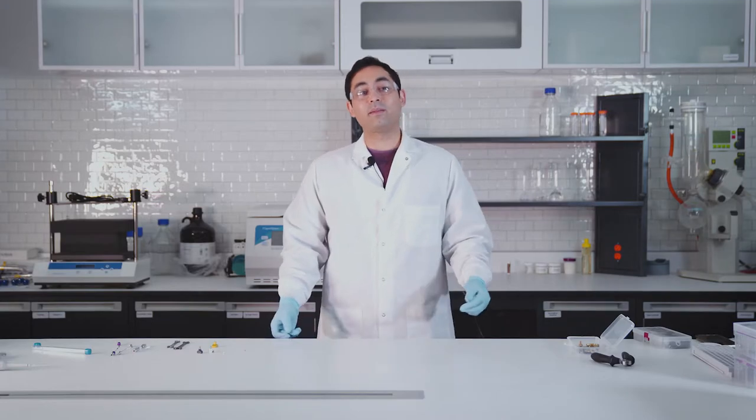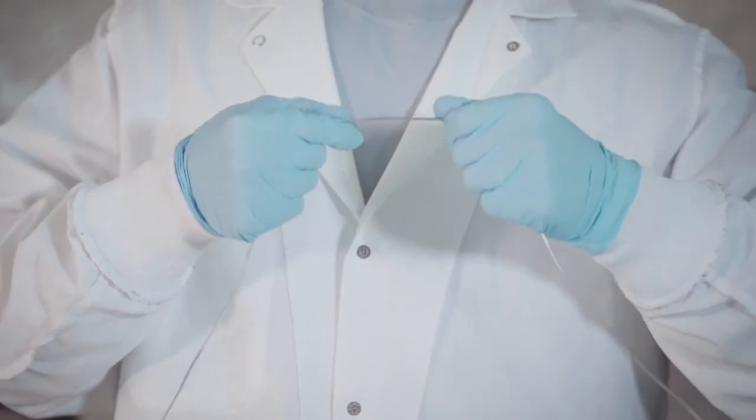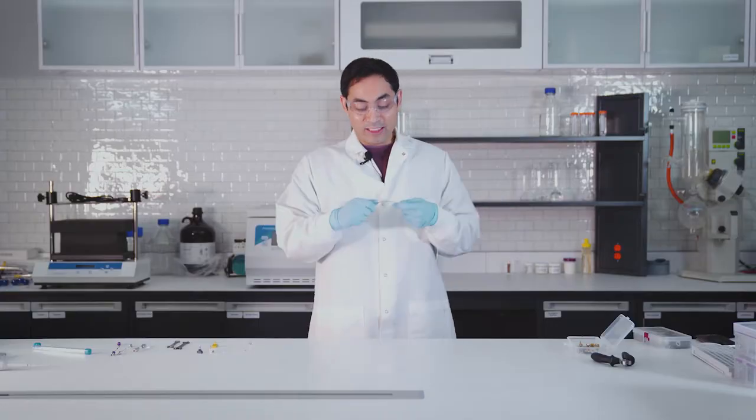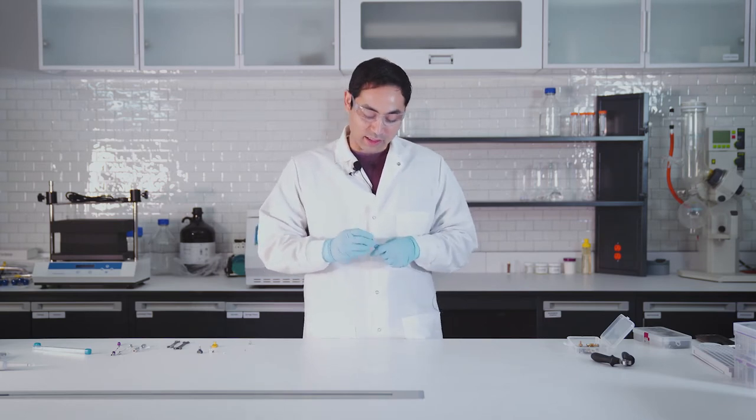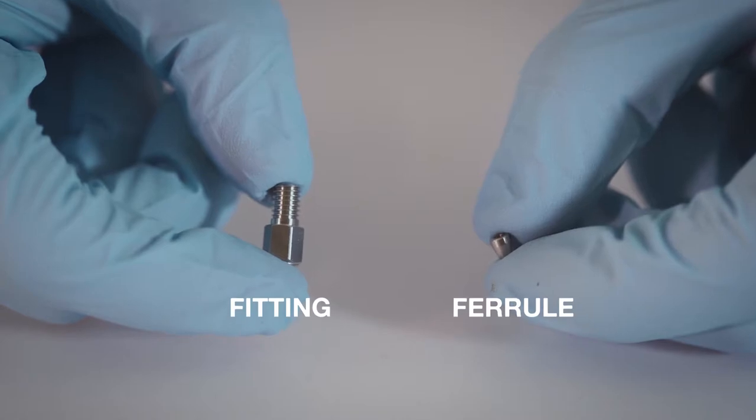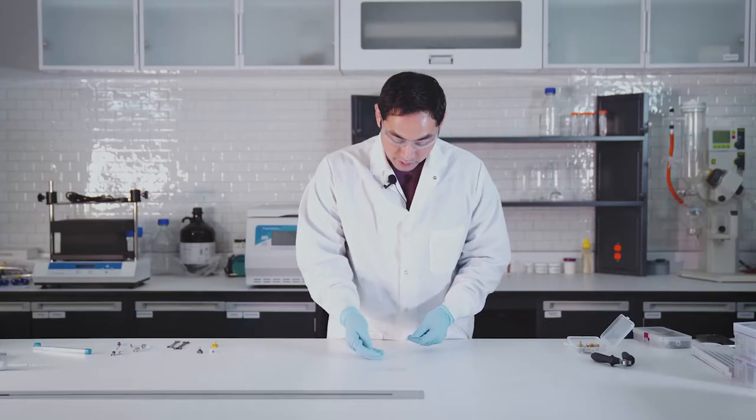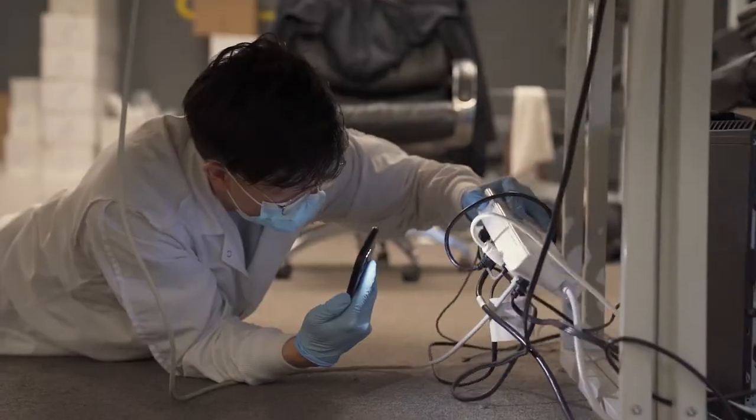But the ones that you see most common are this type of tubing. It's like stainless steel tubing, it's really rigid and really hard to work with. This is really difficult to manipulate, it's really hard to get how you want. And then they come with these fittings and ferrules that come separately. These are really hard to work with, this guy you always lose, you're on the floor looking, it's a mess.